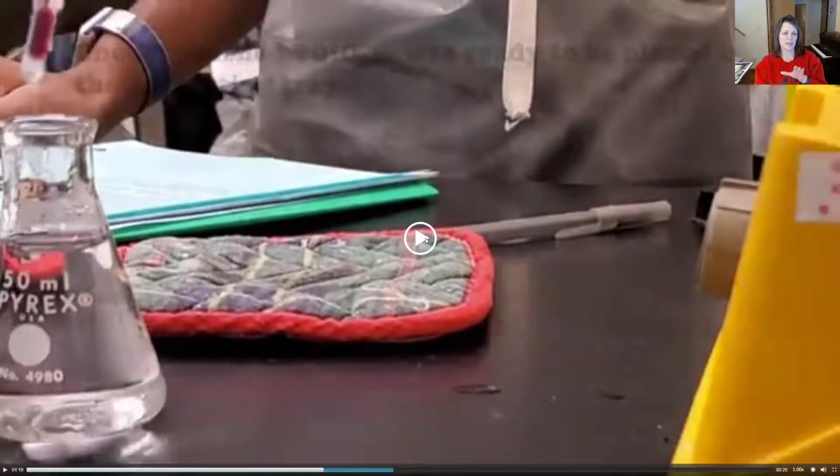The whole reason we need to let this mixture cool is that if you were to pour it at 100 degrees Celsius into our little casting tray with the tape on the sides, you would melt the adhesive on the tape and then everything would just ooze out the sides. So that's why we have to wait for it to cool.